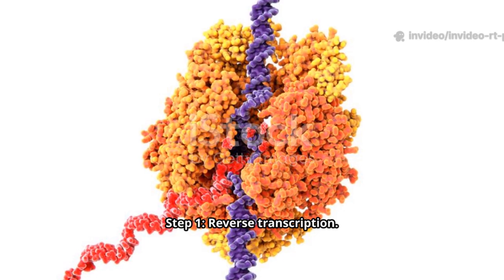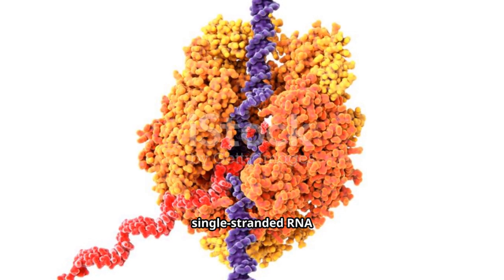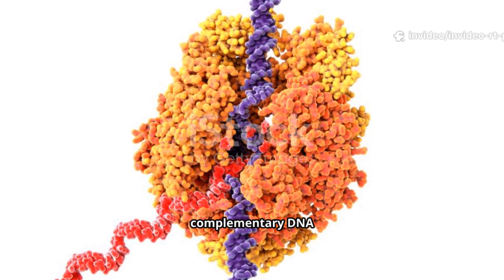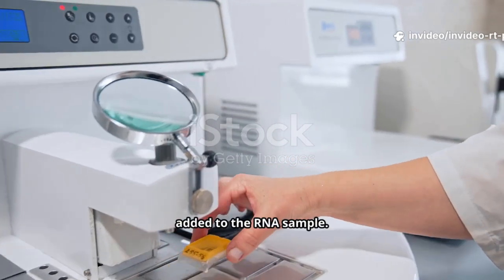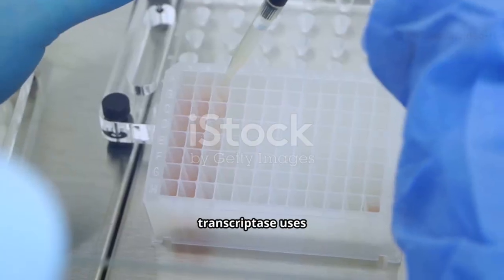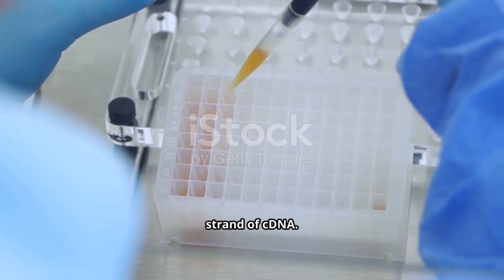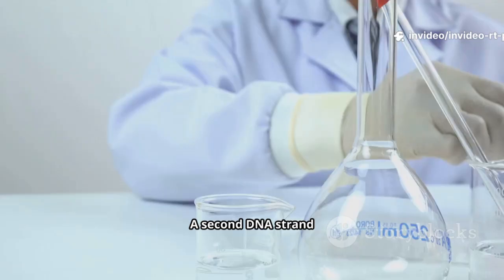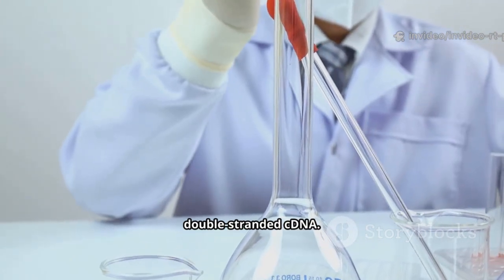Step 1. Reverse transcription. The process begins by converting the unstable single-stranded RNA template into a more stable double-stranded complementary DNA, cDNA, molecule. An enzyme called reverse transcriptase is added to the RNA sample. The reverse transcriptase uses the RNA as a template to synthesize a single strand of cDNA. The original RNA strand is then degraded. A second DNA strand is synthesized to produce a stable, double-stranded cDNA.